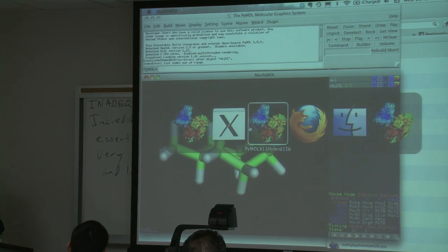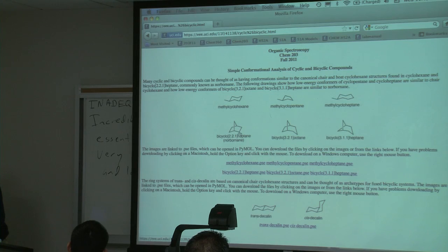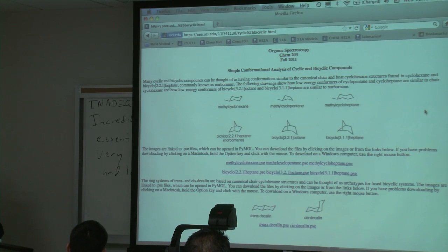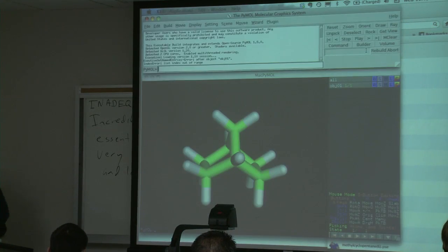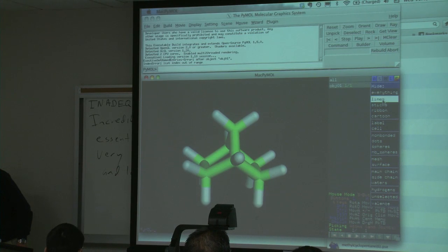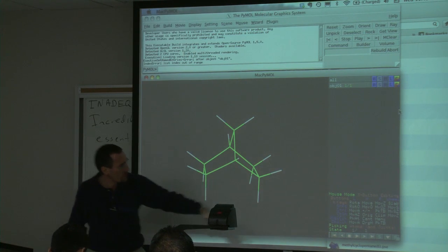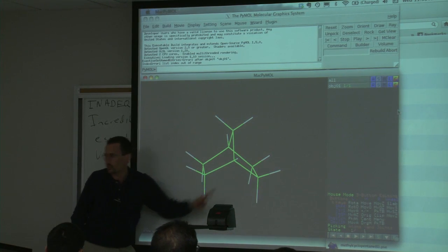The other family I thought was really useful, here's our norbornane structure. These are all minimum energy structures. The clean function generates them with molecular mechanics with the MMFF force field. So here's the norbornane structure. If you want to see the projection that I drew over there, what I badly sketched out on the blackboard, that's our basic structure.